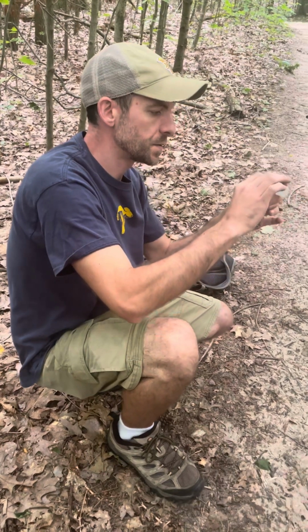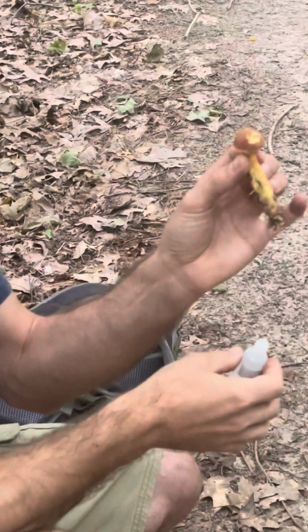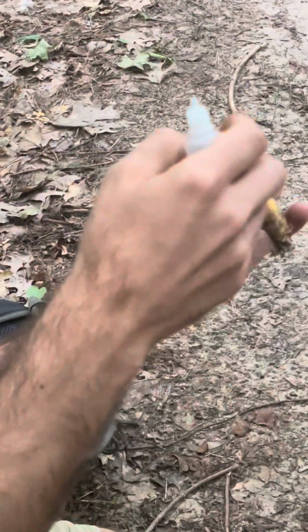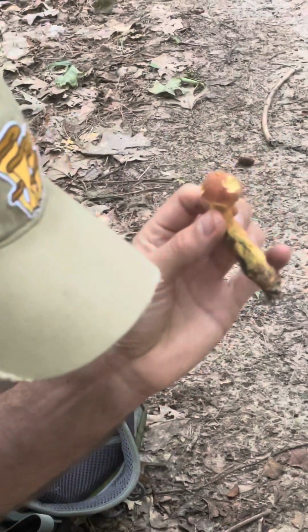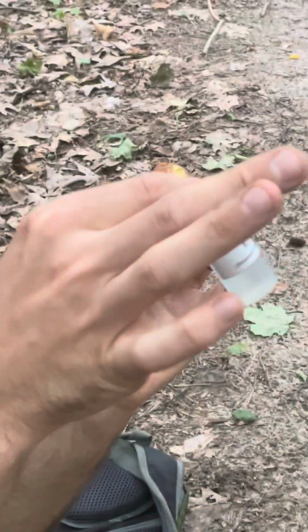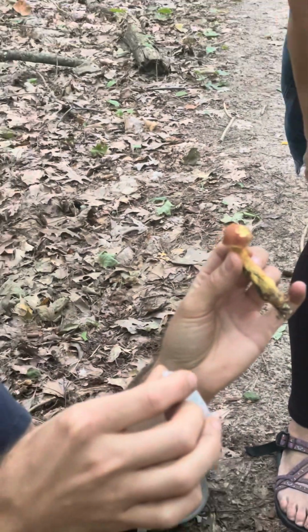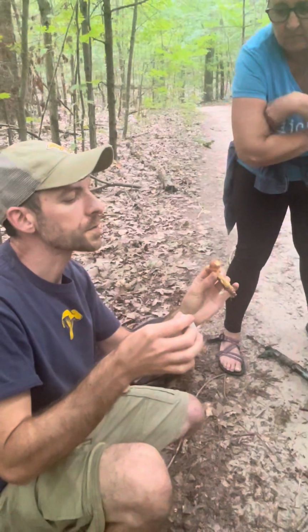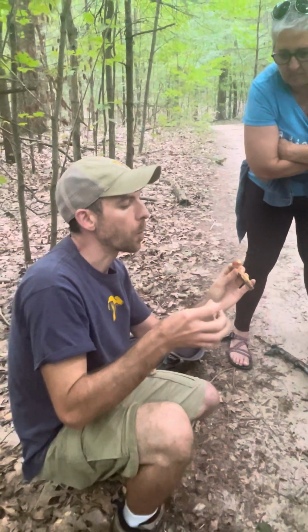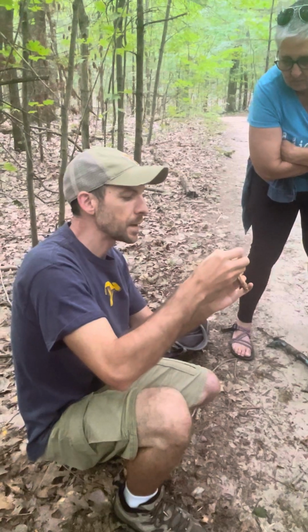What you can do is drop it on the cap, on the stem, anywhere you like. I usually like to drop it on the cap at first just to see if there's any type of reaction. This is also used in microscopy, which is a very common tool used in identification of mushrooms. You use the microscope to look at spores, and this is also used to mount the spores on the slides.